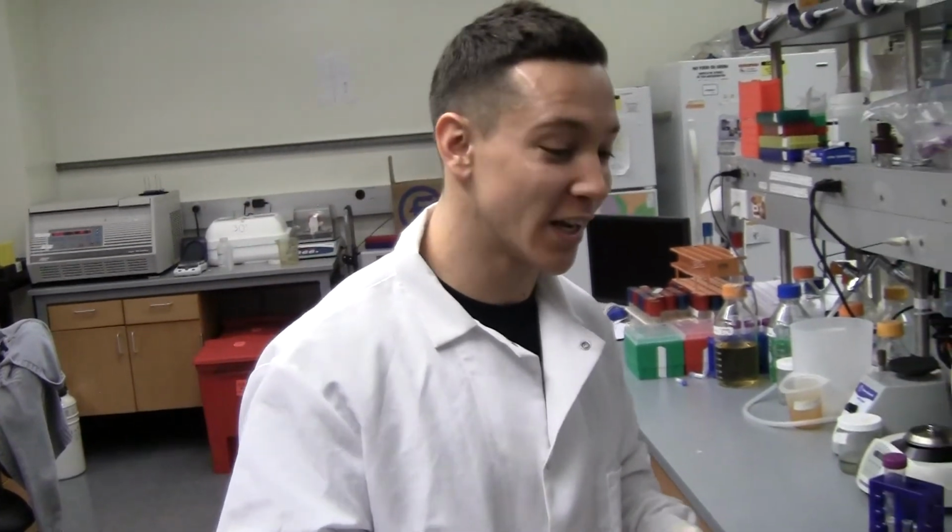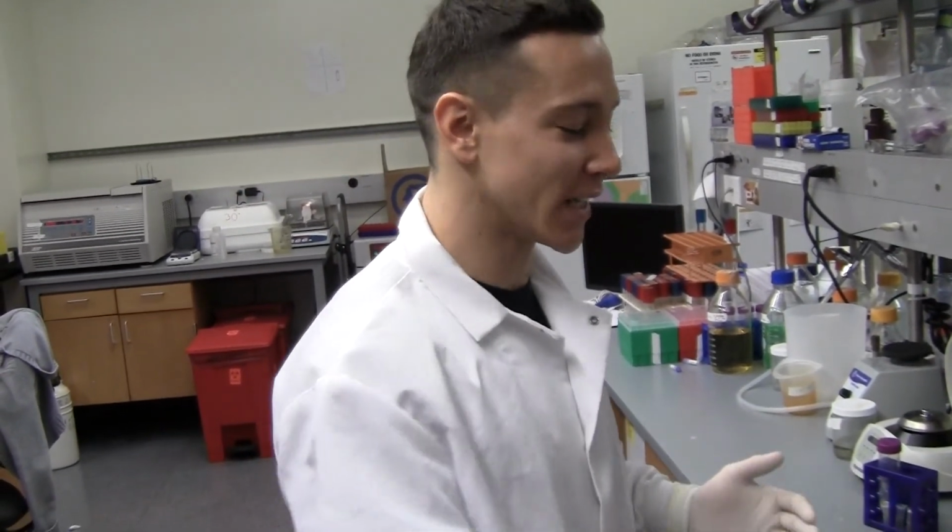But we're going to be going over how to do top agar and how to do titers on phage. That's probably the more important practical thing. I'll probably put a note in the beginning of this video warning people that this is just extra and it's not necessary to understand how to do this technique. It's a pretty common phage wet lab technique.